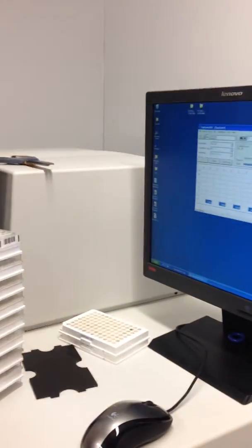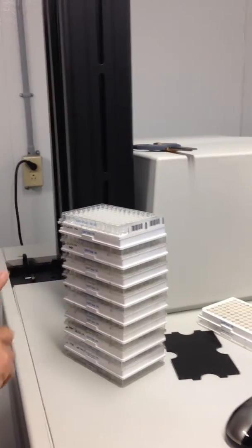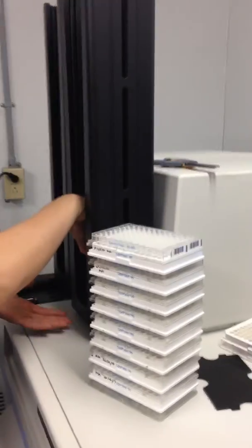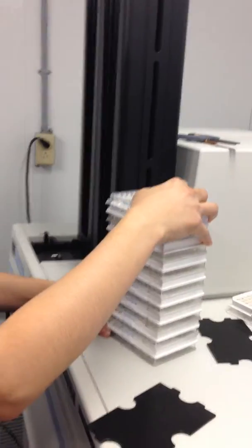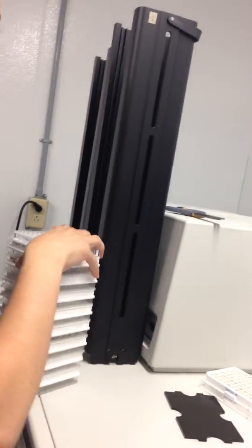Okay. So here it has started the calibration. Okay, so now that you've written the position, the date, the machine, and all that, we can put those in the stackers until we are ready to start. Jay, just one question. So would this be position 1 and 2? Position 1, position 2. Okay. Yes. When you look at your data file, the blank plates are not stored because we've told the assay to not take readings from the blank plates.